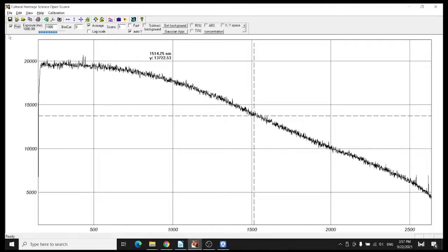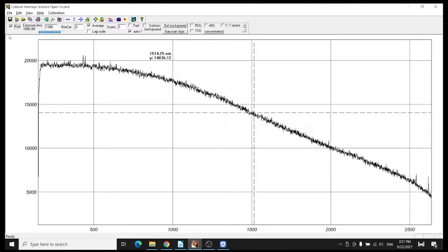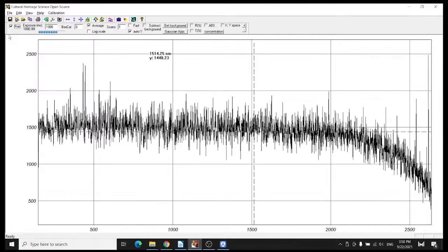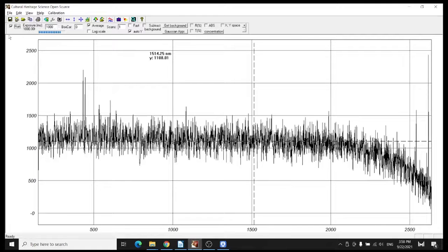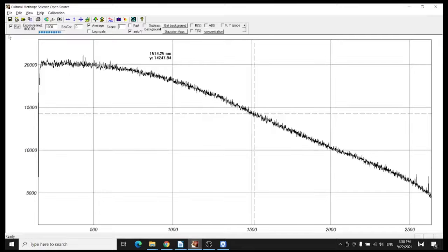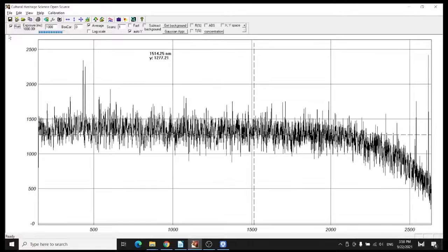Be sure when you do Raman spectroscopy that you don't input noise in the environment. Then remember to turn off the LED light of the camera. You see there is a big difference. Now we have the light on from the camera, and then this is when it's off. So remember to turn it off.